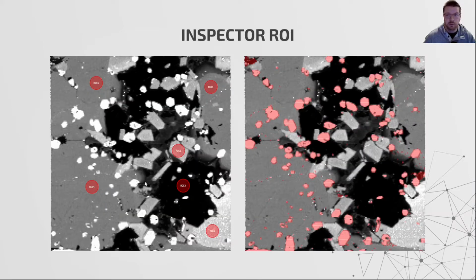So here's just an example of this idea that some regions of interest could be represented geometrically. On the left here, we have a bunch of different ROIs that are just circles that were probably created with the loop. And then on the right, we have a disjoint ROI that was created from criteria to pick out these different apatite.